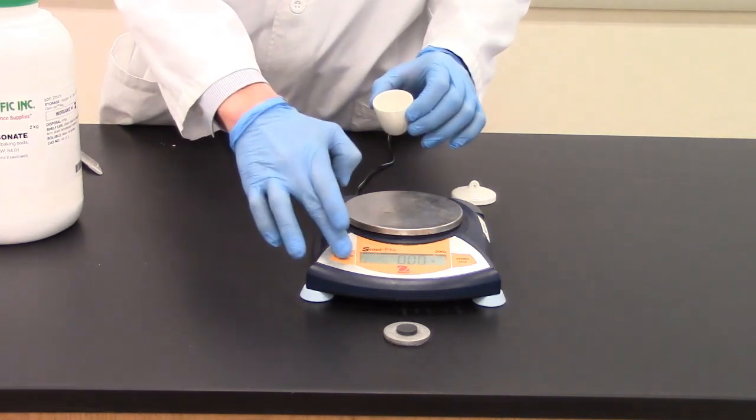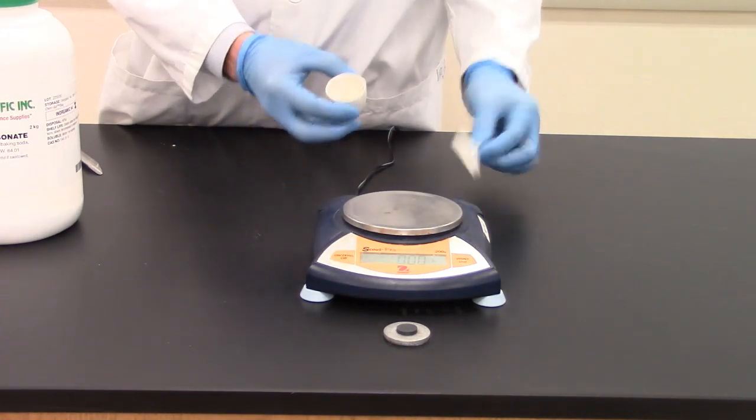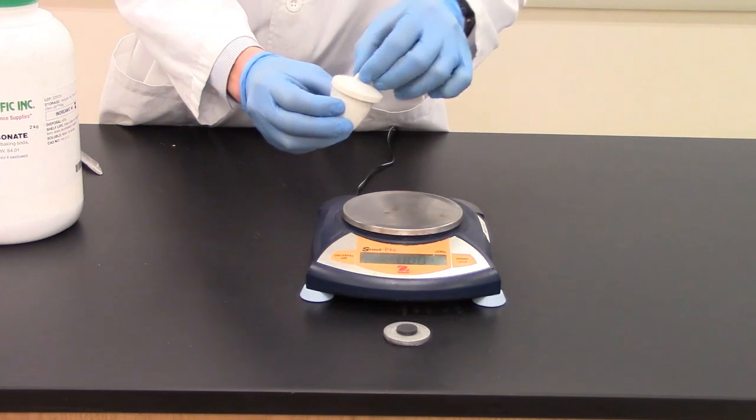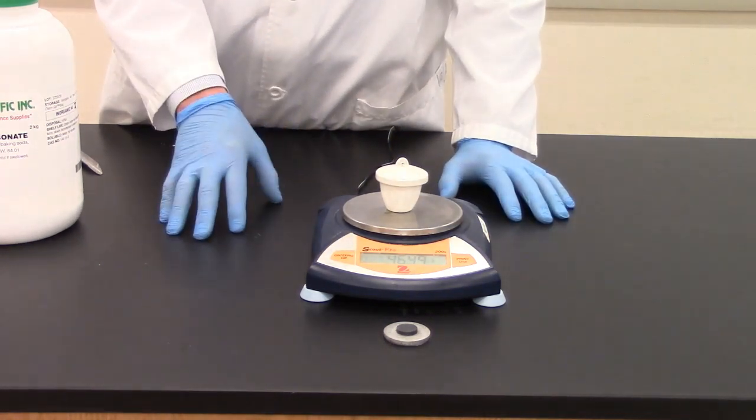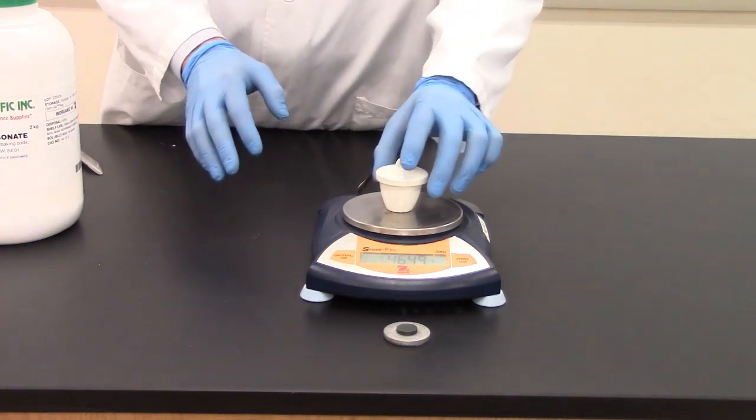Alright, and then I'm going to zero out my balance and place both the crucible and the lid on the balance to get a measurement. So I've got my mass of the crucible. Yours is going to be different.